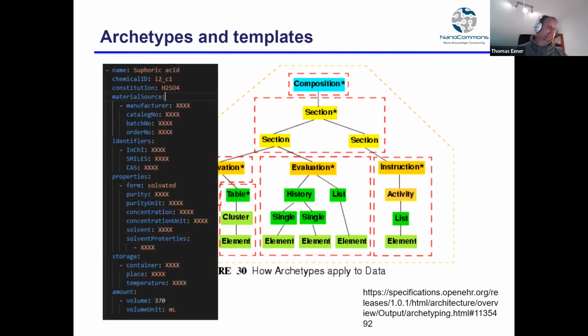One of these articles, or just going back to this YAML thing, but I still hope that this is not actually so complex to understand. But all these things are just hierarchies. Therefore, this is something where you would say, I put these things together, and a property would have, in principle, a standard form, or a compound would have the standard properties. You can guide them, that you can record on the storage. You definitely have to record on the manufacturing, where all these comes from. And since we have these things already, people would hopefully not forget about it.